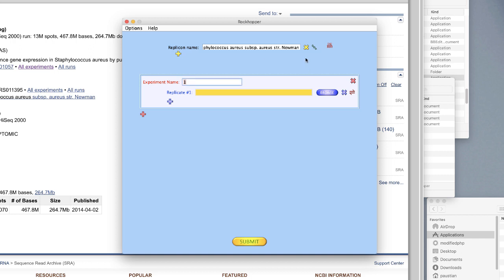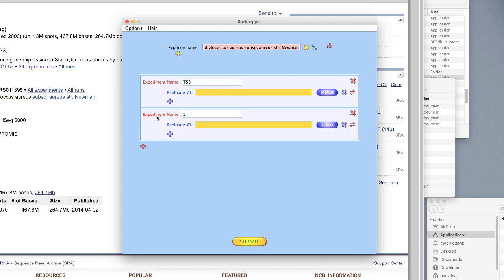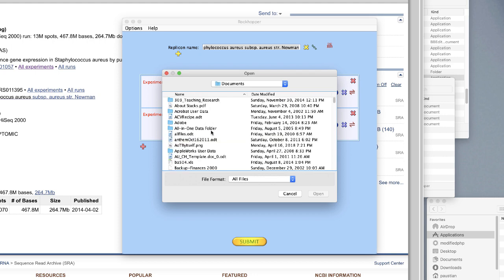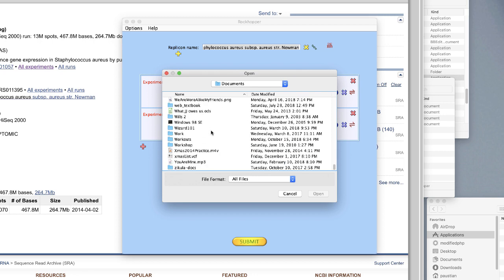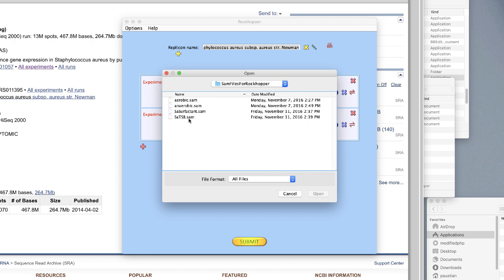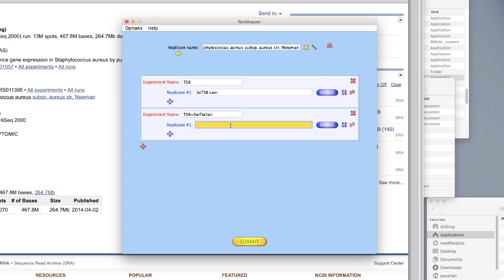We don't need the extra replicon so we're going to get rid of it, but you'll need it later. We're going to do two conditions: one is TSB and the other is TSB plus surfactant. Now we need to put in the RNA-seq data. I'll choose browse, go to my documents folder, and it's called SAM files for RockHopper. Here's the TSB experiment SAM file — I downloaded this data and converted it into a SAM file, which is what RockHopper understands. And now we go to the surfactant one.